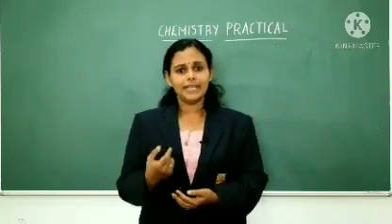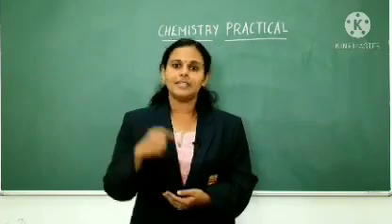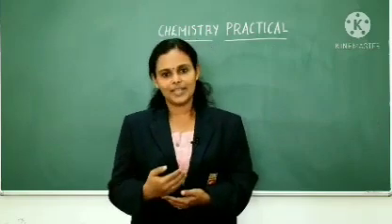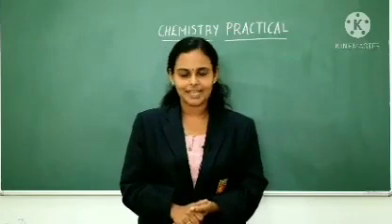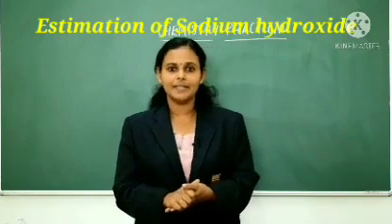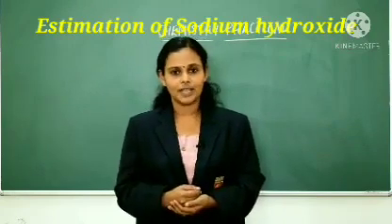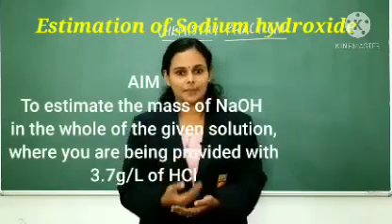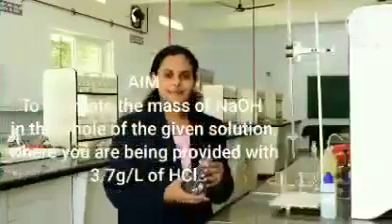There are many new terms which will not be familiar to you. As we do the experiment, you can see what they are and what the definitions are. So let's do the practical and see. Today's experiment is estimation of sodium hydroxide. For this experiment, the aim is to estimate the mass of sodium hydroxide in the whole of the given solution. For this, you have been provided with 3.7 gram per liter of HCl.